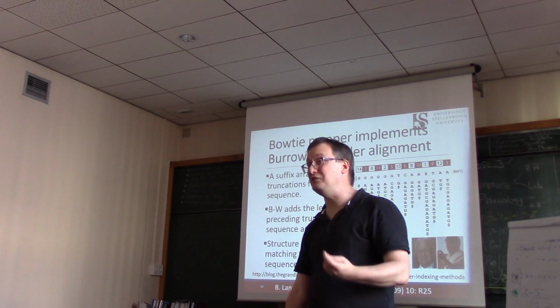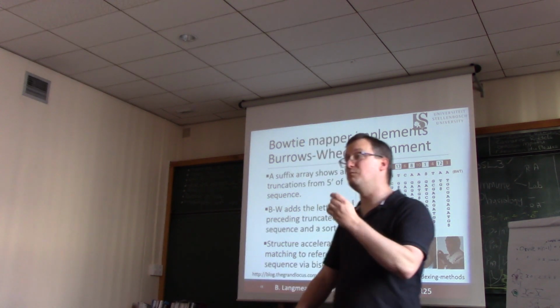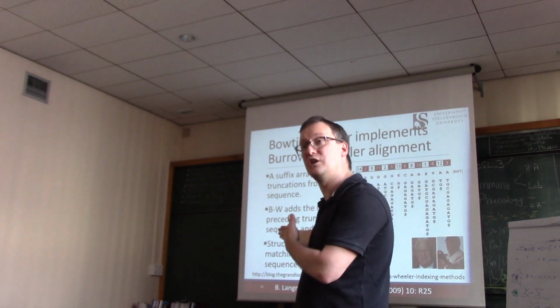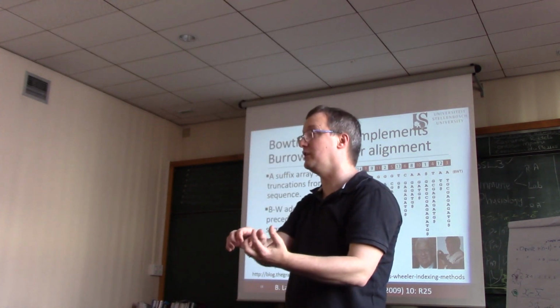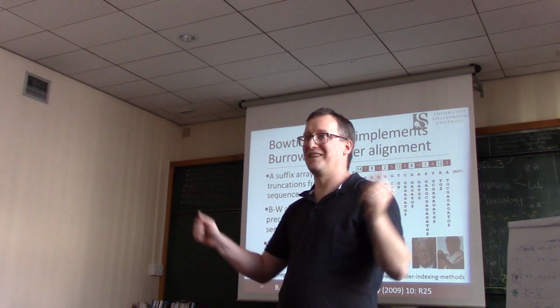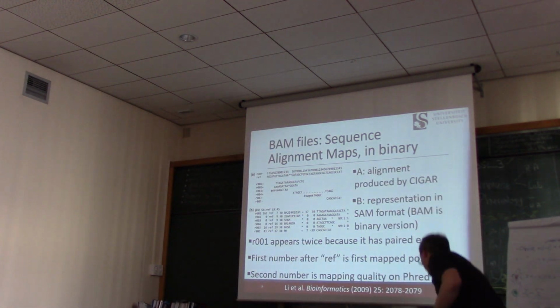That is highly efficient, and it represents one of these places where computer science has made these technologies feasible for everyday use. So that's what you should know about Bowtie. It is the ability to build one data structure from all of the reads and then pass the whole annotation through it and find hits for any read to any gene. Freaking amazing. Okay, now what comes from that?